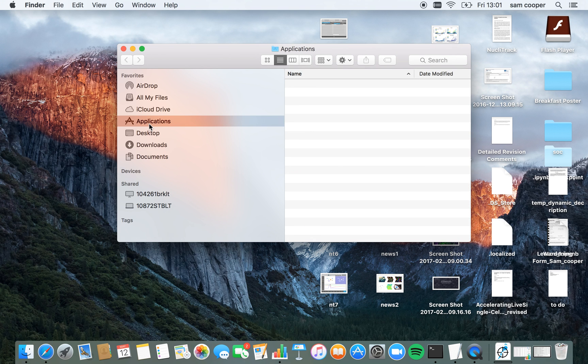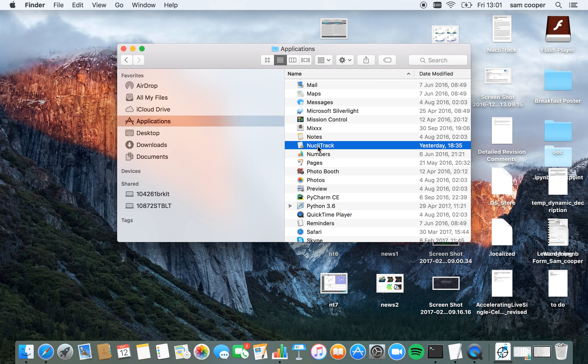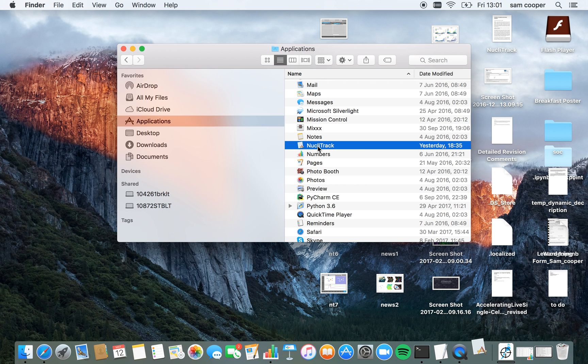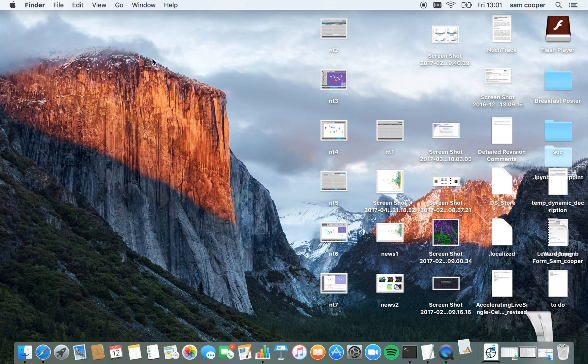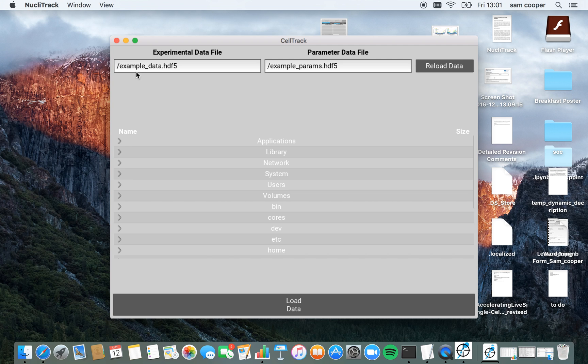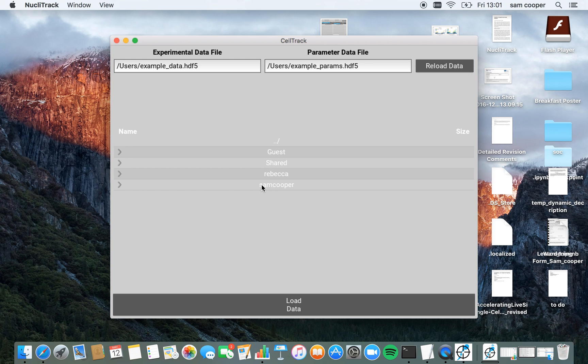I have this saved to my applications folder on my Mac. Now NucleoTrack is loaded up, I'm going to navigate to where I've downloaded the HL60 simulated example from the NucleoTrack website.